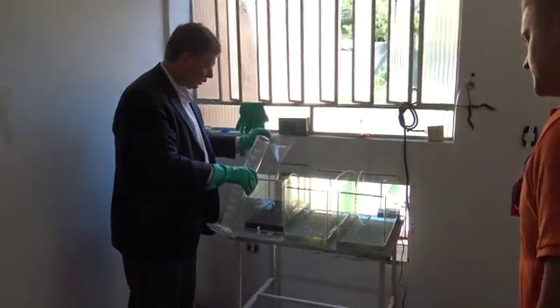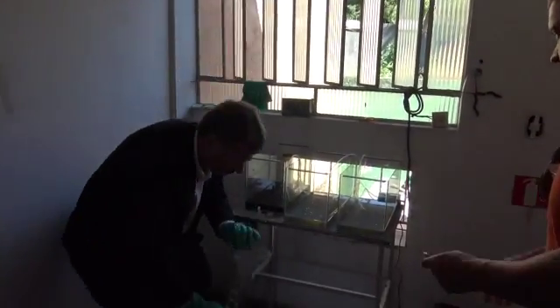The sediment with the oil is quite hard, more like clay.